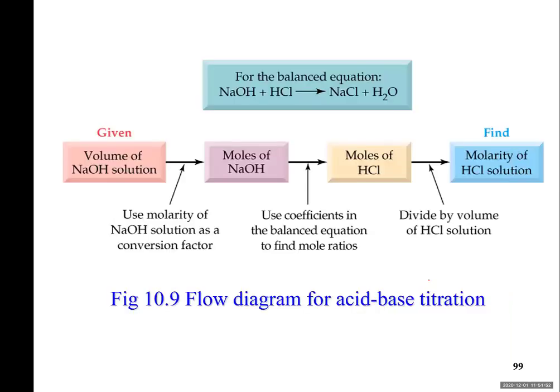And then you have the molarity of NaOH, which is written on the flask. You just measure the volumes of NaOH by reading the burette. Can you calculate the number of moles of NaOH? Well, how do you calculate number of moles?